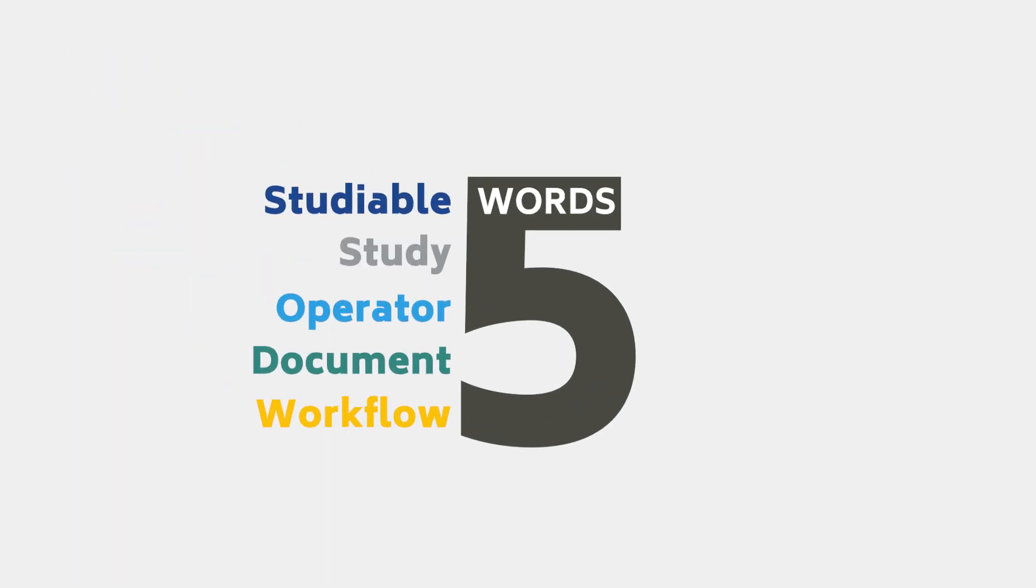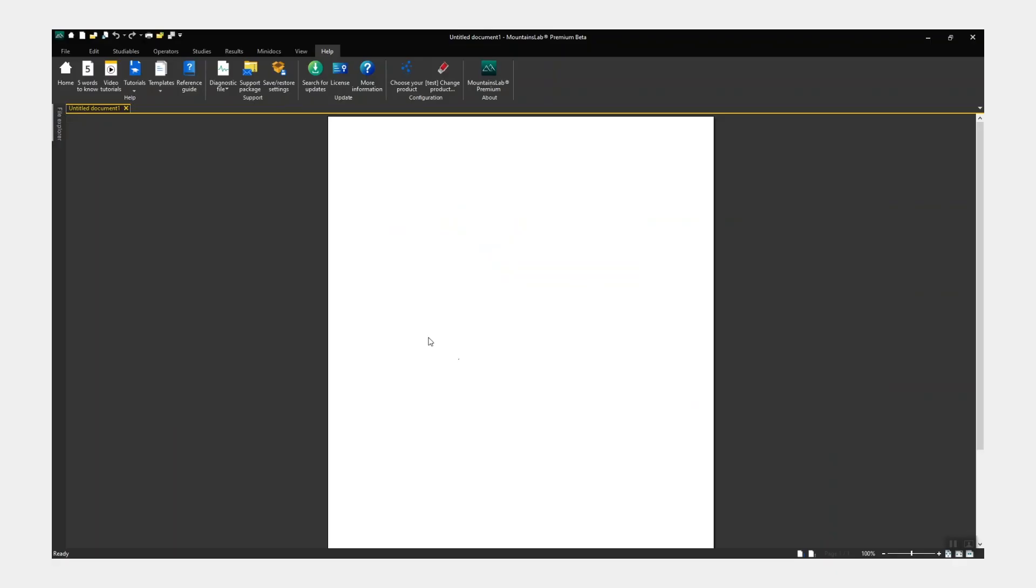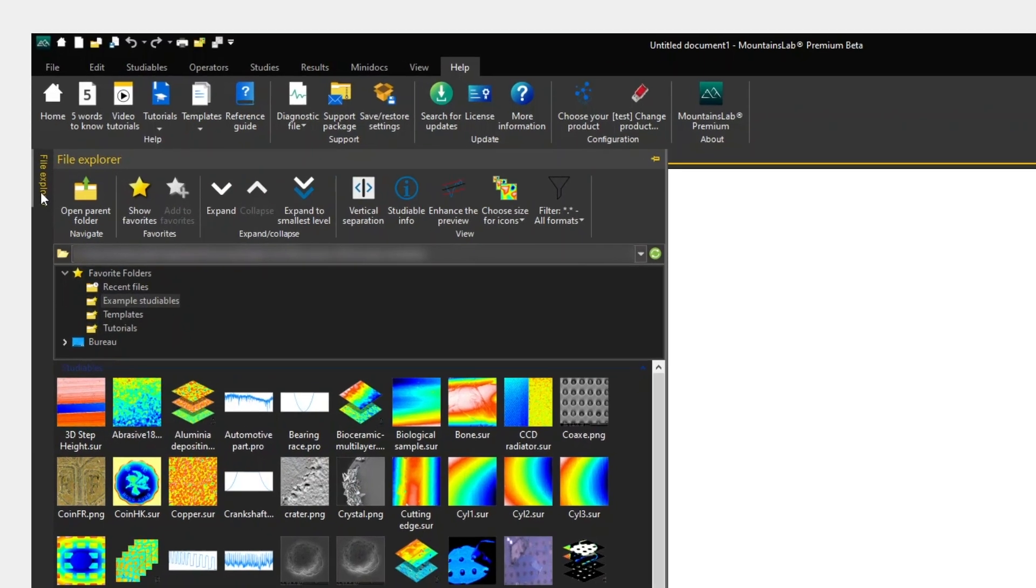Now that we've mastered the basics, let's open MOUNTAINS and create a new document. The file explorer can be accessed on the left and lets you browse to documents and studyables.